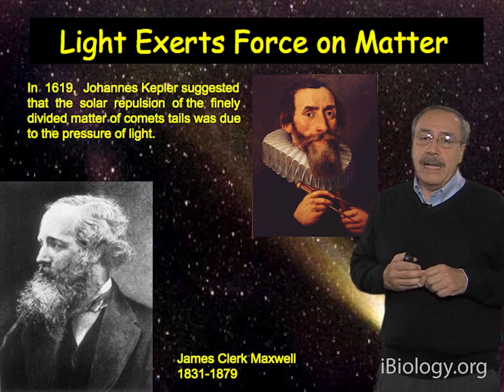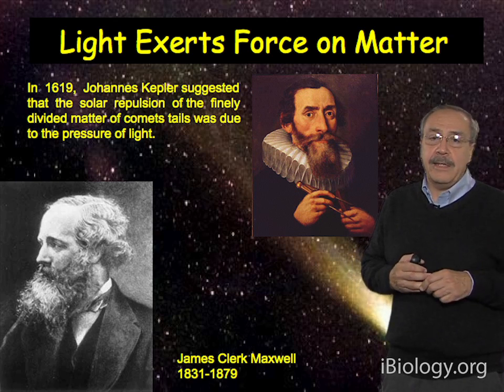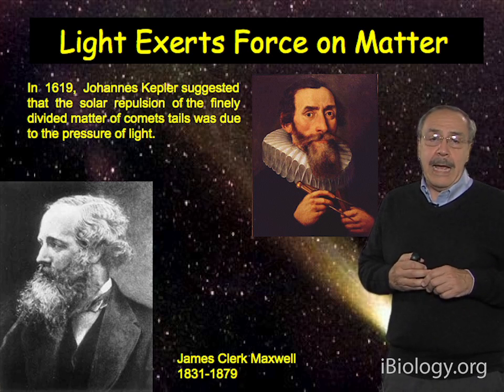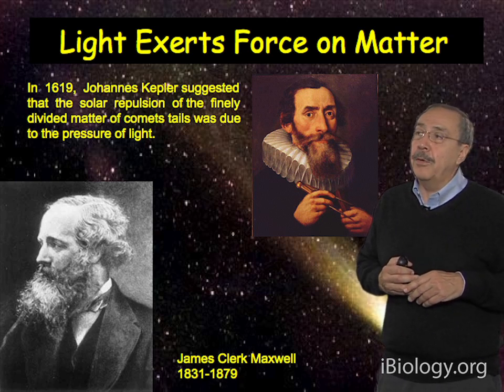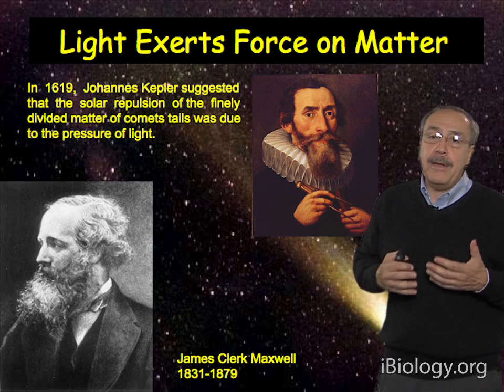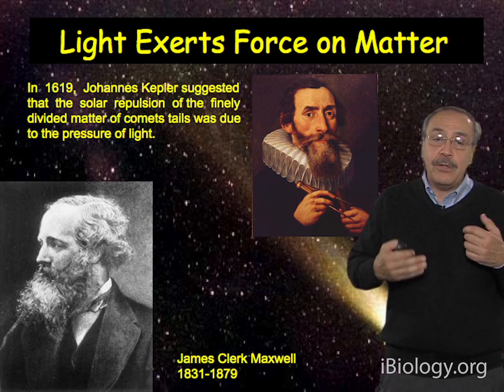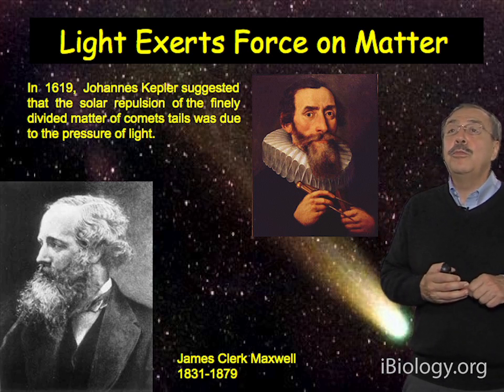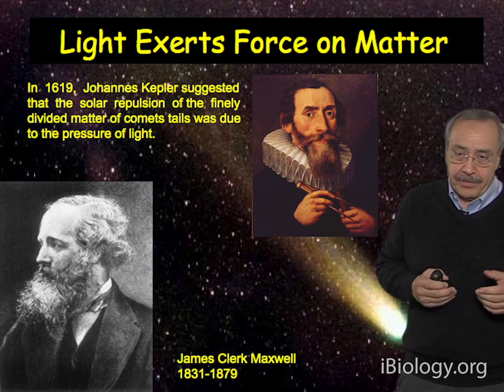And so, as you see, this idea is very early. Newton considered this idea in his optics book and considered it plausible. And later on, James Clerk Maxwell, when he developed the 4 equations that describe all the theory of electromagnetism, was able to predict theoretically that light should be able to exert pressure and forces on matter.